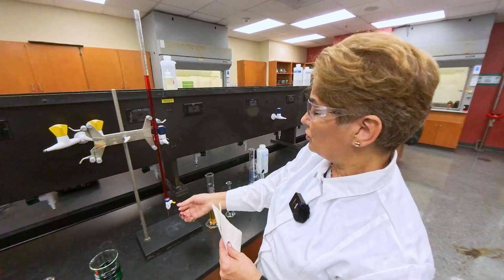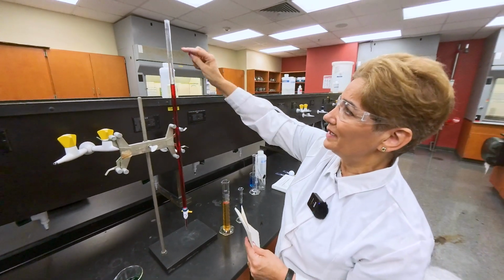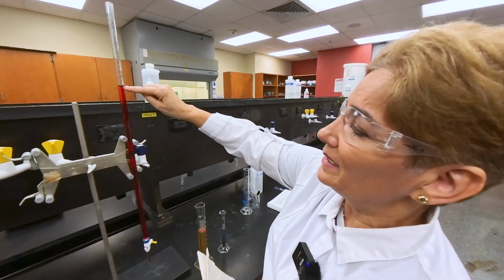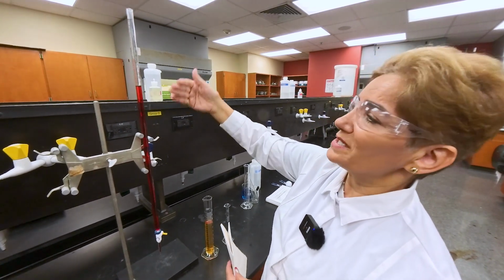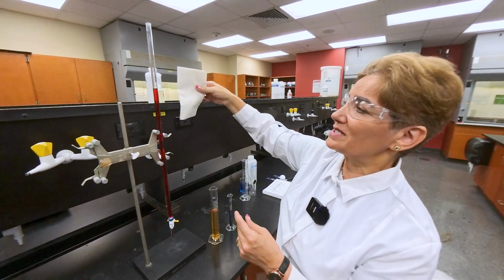Burette is used to transfer liquid out. So let's say I want 10 milliliters: I start from 0 and go down to exactly 10. Or if I start at 13 and transfer down here, I want to find out how much has been transferred. You will use this for the following experiments, but for today's purpose, just learn how to read this number.